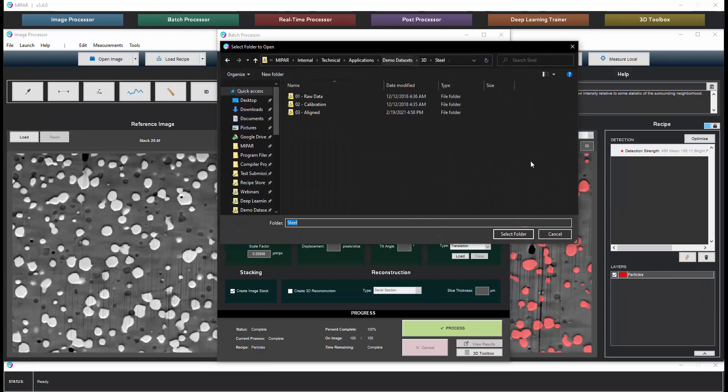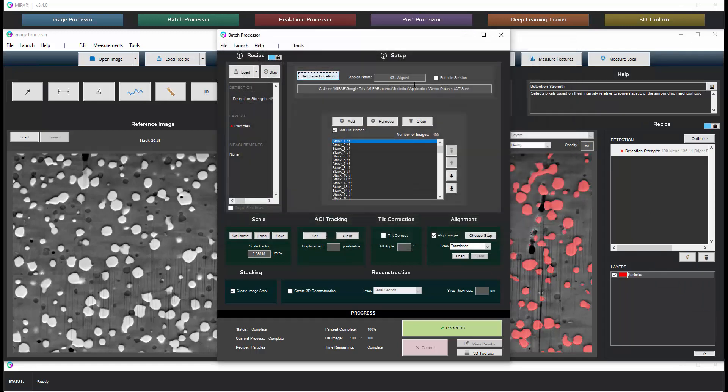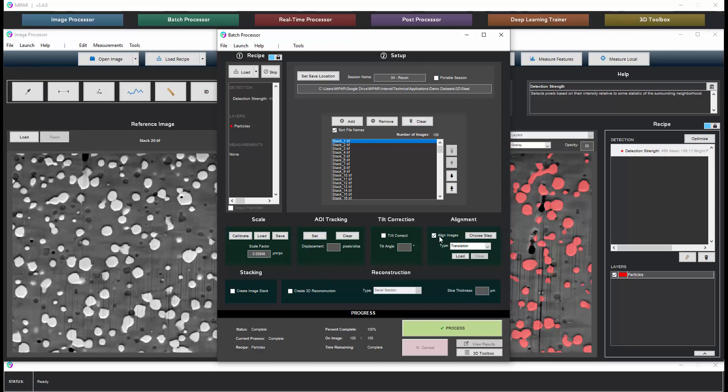We will again choose our output location and in this case we're going to output everything to a recon folder. Here's the scale factor. In this case we will not create an image stack or align the images further. We will make a reconstruction this time with a slice thickness that I know to be 50 nanometers for this data set.